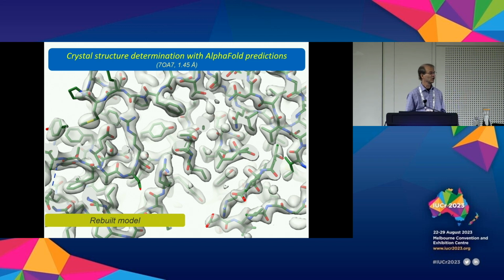experience. If you had a low resolution structure, not so easy, of course. A lot more to do. But that's the basic thing: AlphaFold jump-started this whole thing, right? You didn't have to find a homology model that wasn't all that good and figure out what the right sequence alignment was and everything. Boom. You're right there. Okay, so very handy. Works great, particularly if you have a good prediction, most of it is high confidence, and you have good data, you're in really great shape.